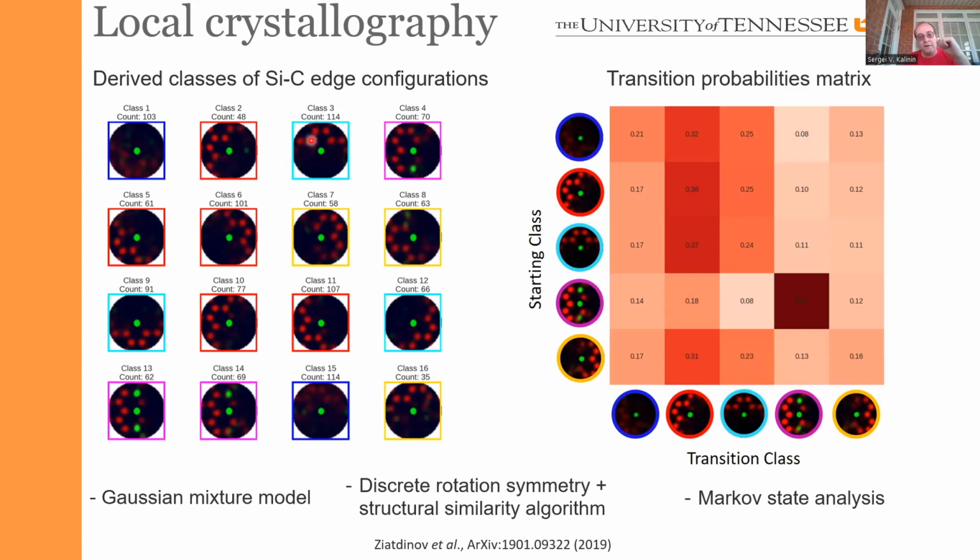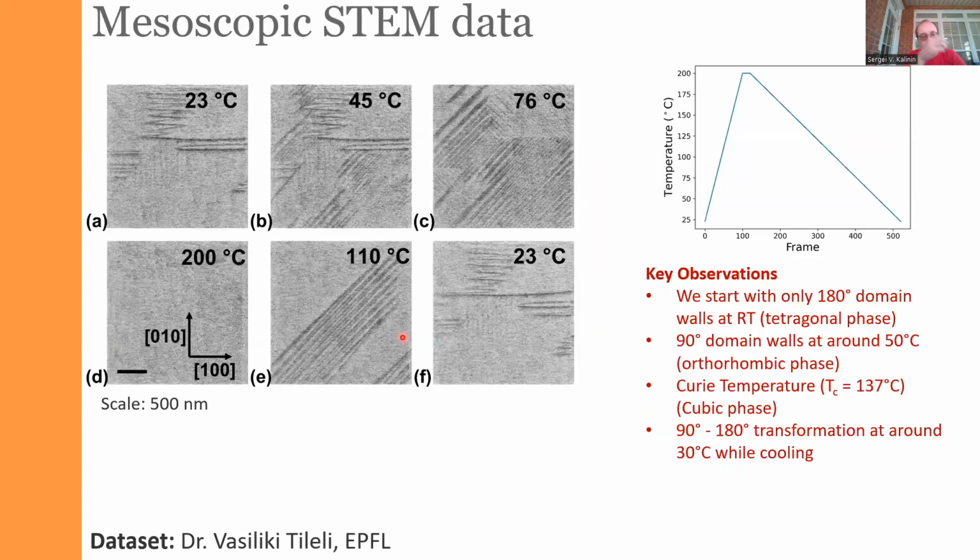This one and this one are the same physically, they differ only by the rotation in the image plane. This is the limitation of the image method. They create too many classes. Sometimes you can manually combine them. Practically, the better solution is to use rotationally invariant autoencoders because they already allow to do that without the manual assembly. But it does not mean that it cannot be done by the other methods.